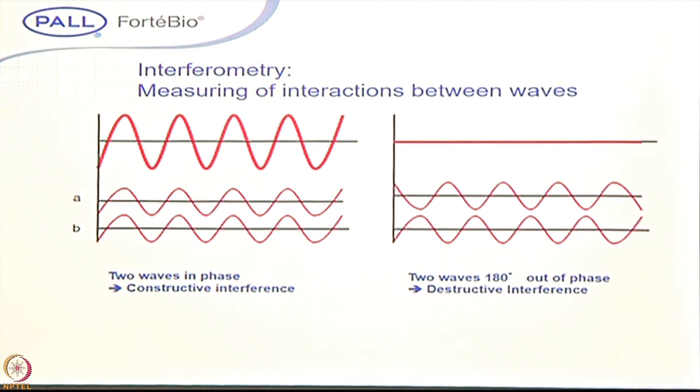Except for mass spectrometry, the rest of the analytical techniques are all light based. As you know, light has a wave property. When interference occurs, that is where BLI, biolayer interferometry, comes in. The interference patterns make the signal pattern here. As I mentioned, it works on the wave property.